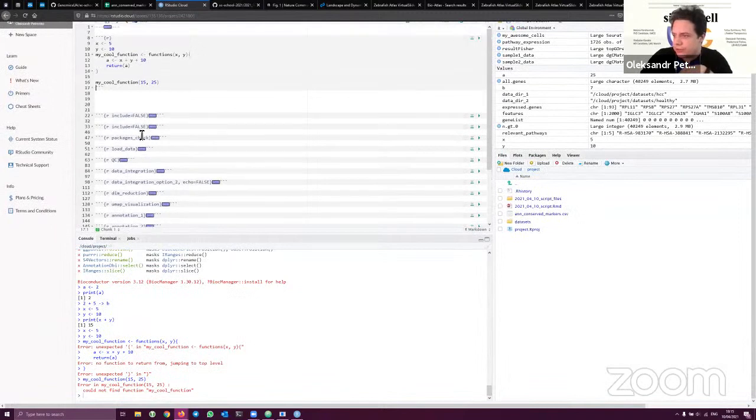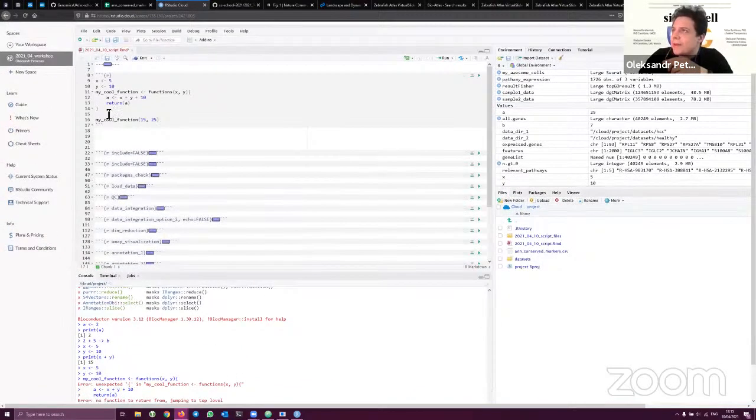Oh, okay. So I did something wrong. It's extremely stupid if I am mistaken with some syntax right now.